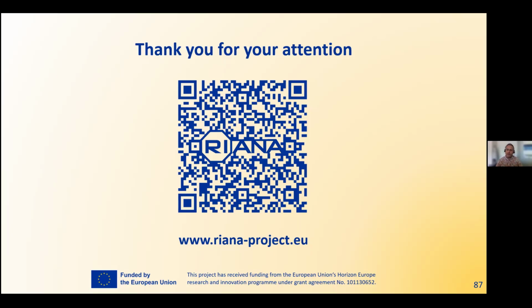So you said there can be some errors up to 100%, meaning what the technique could actually give on the results? Well, that depends on the edges, that depends on the elements, and that depends also on, for example, the detection limit, so it's very case specific in that sense. But modern software can quite well give you a quantification down to 1% or 10%.